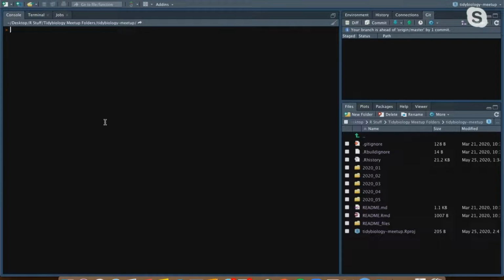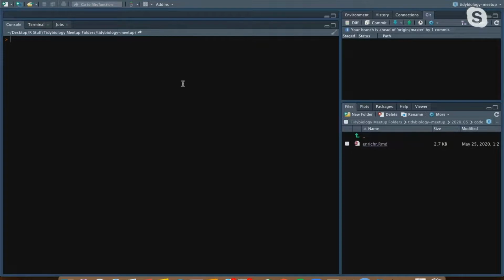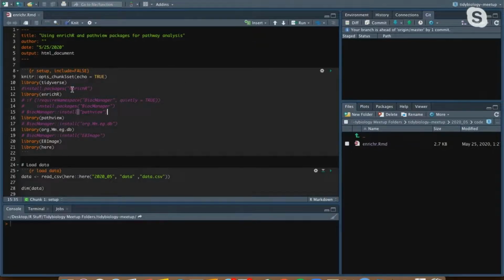All right. So before we begin, make sure that there are a number of packages we'll need to use.